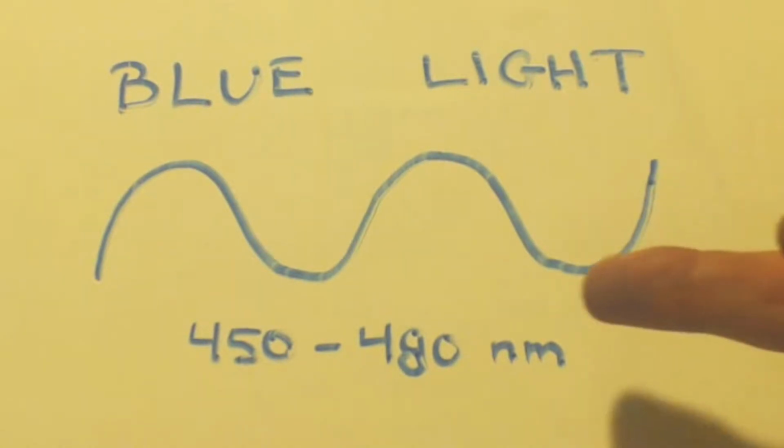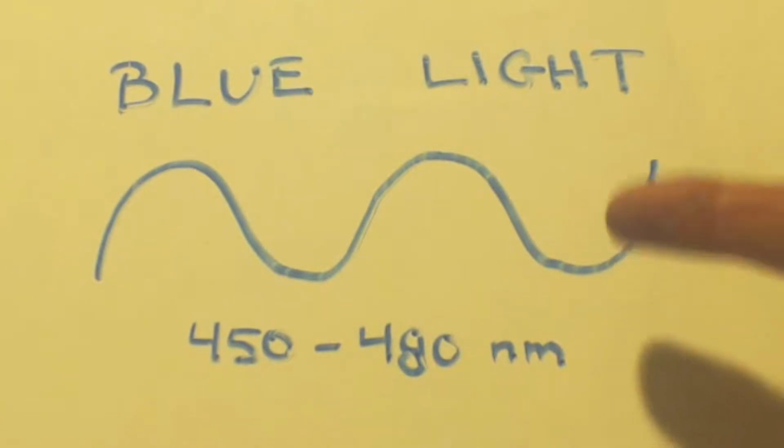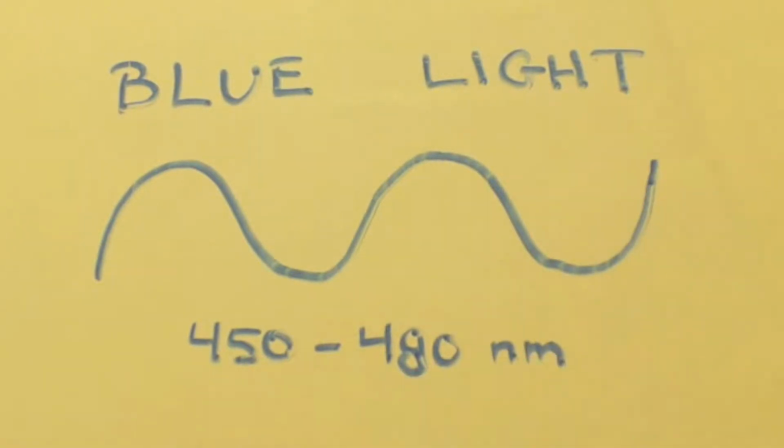So this would be perfect if we could just make this wavelength light, or this range of wavelengths, and only that range. And we said that UV was actually too strong, not for any other type of chlorination, but for a benzyl chlorination. UV, even violet light, is too strong for the reaction.